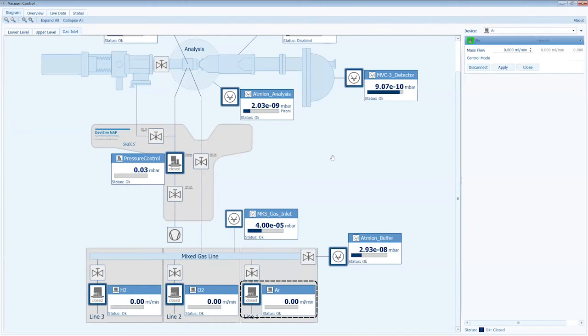Because you understand that, depending on the flow, you will create here a mixture, and this mixture will contain the concentration of each gas, which is proportional to the flows which are used in the flow control. And then here these gases are mixed, and then using a tube which is introduced to the NAPXPS.